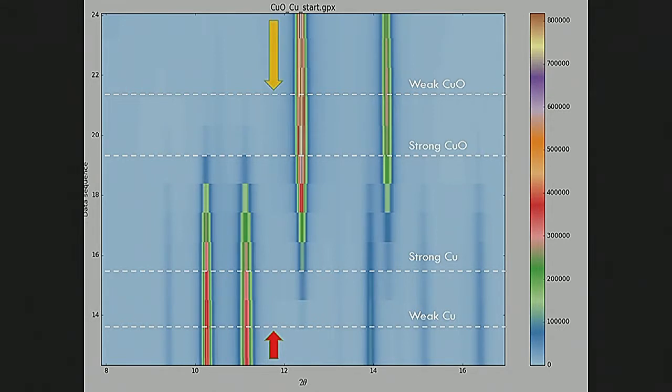And then we refine from the other direction as well. Again, it's not really important which one happens first, but there are more patterns down here to refine. And so then you take the parameters that are in common between all of them. You copy them to these regions, and you refine from weak to strong or weak to strong. I didn't add an arrow for that because it doesn't really matter which direction you go in.